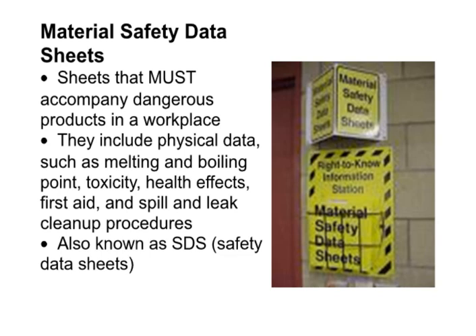The last thing we need to talk about today is something called a material safety data sheet. And again, in 2015, to make things a little bit more streamlined, they actually changed these, and now it's called a safety data sheet. So they just took the M off the word. Rather than it being an MSDS, it's now called an SDS.